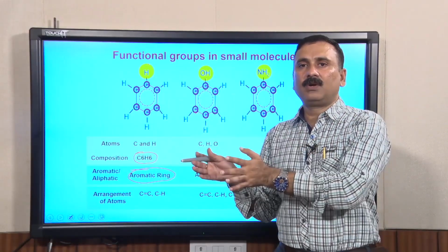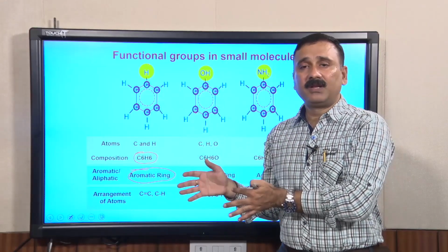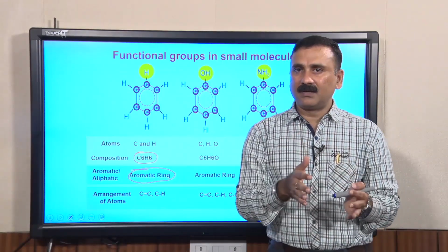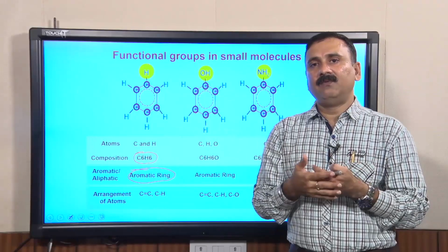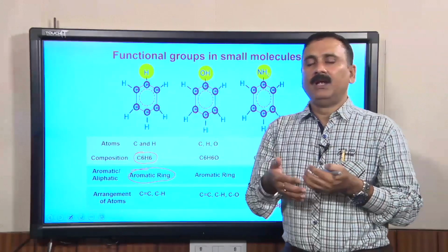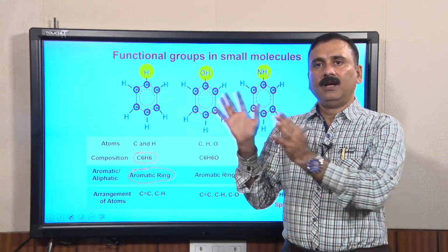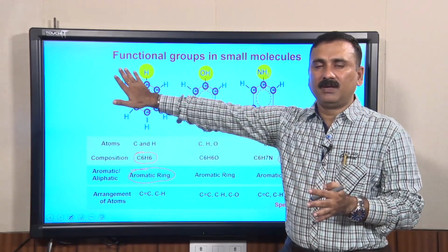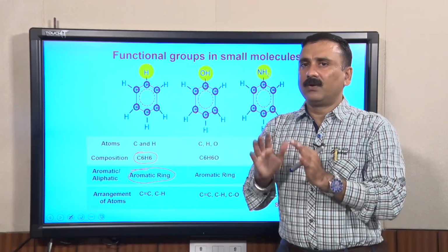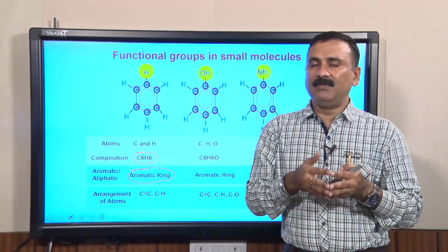And then subsequently you can do IR spectroscopy or UV visible spectroscopy of this compound, and you can put pure benzene as a standard compound and then overlay, and if the overlay matches, then it will say it could be benzene. Then you can collect the IR spectrum, and if that also matches with this compound, then that will say the compound you have isolated from the host cells is definitely benzene.